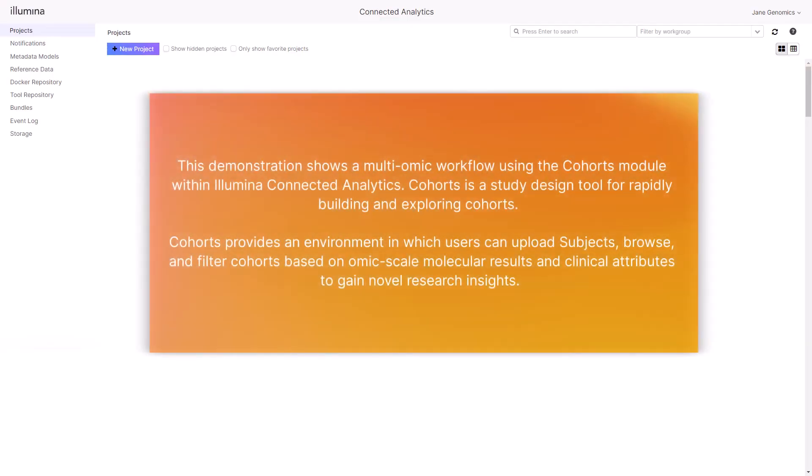This demonstration shows a multi-OMIC workflow using the Cohorts module within Illumina Connected Analytics. Cohorts is a study design tool for rapidly building and exploring cohorts. Cohorts provides an environment in which users can upload subjects, browse, and filter cohorts based on OMIC scale molecular results and clinical attributes to gain novel research insights.